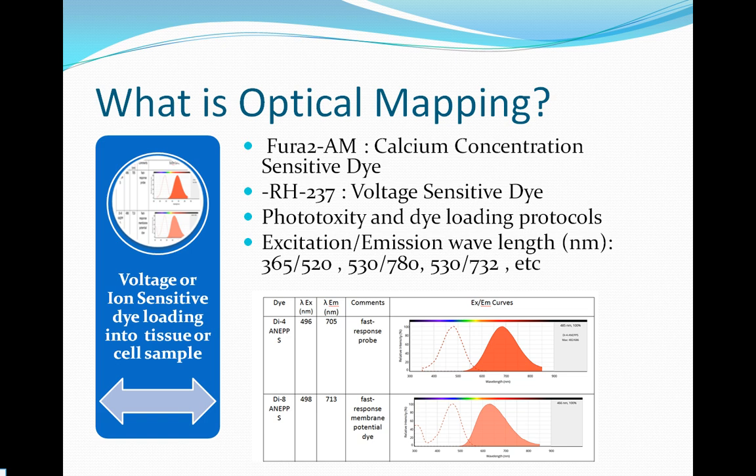These dyes have excitation and emission wavelengths. For example, in this table, we can see the wavelengths for excitation and proper emission for the dye.